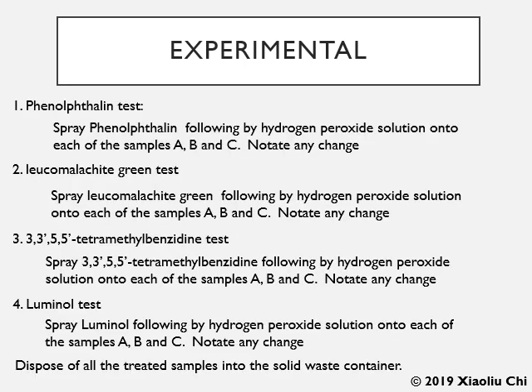As mentioned before, you are going to apply 4 dyes with hydrogen peroxide to 3 samples. After the test, dispose all the treated samples into the solid waste container.